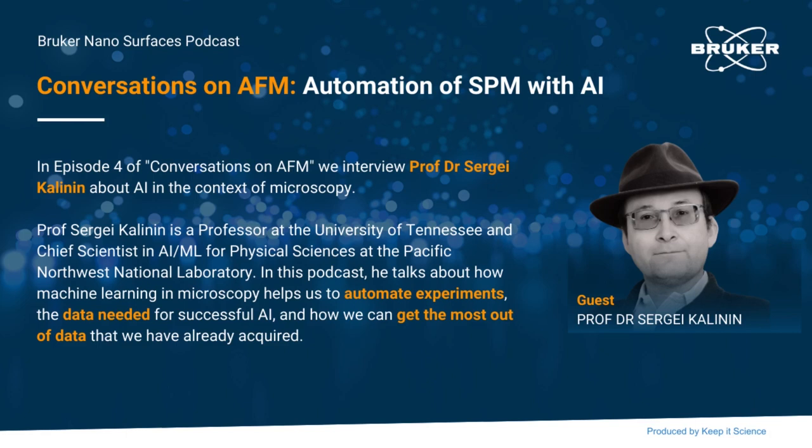So as a simple example, if I run the microscope during the first time of the day, my reward function is imaging optimization. Then my reward becomes curiosity. So I want to quantify what are the objects in the system. After that, my reward will become hypothesis testing. So I have some idea about what type of behaviors should manifest in this material. I run my experiment in such a way as to prove or disprove this hypothesis.